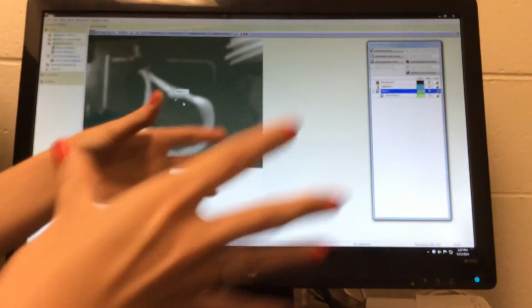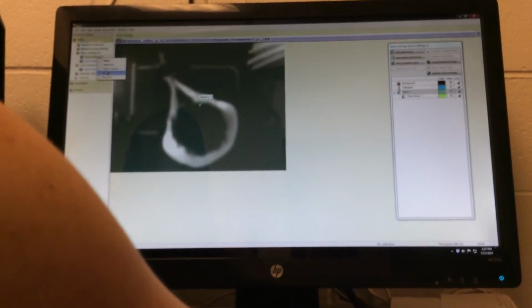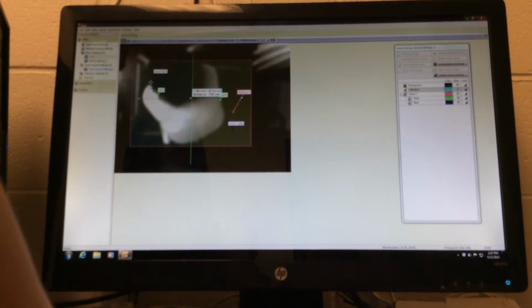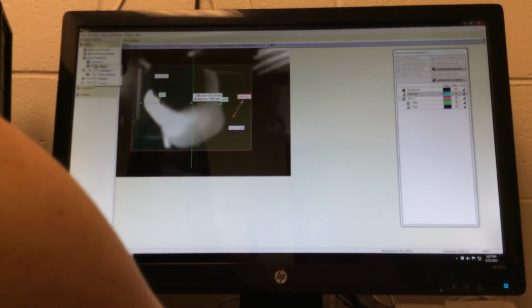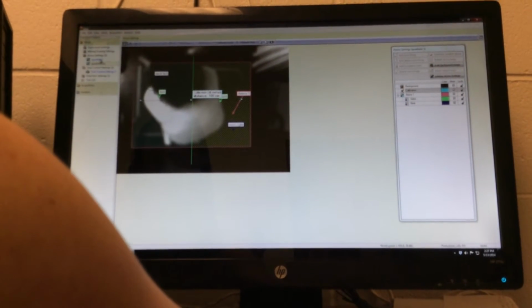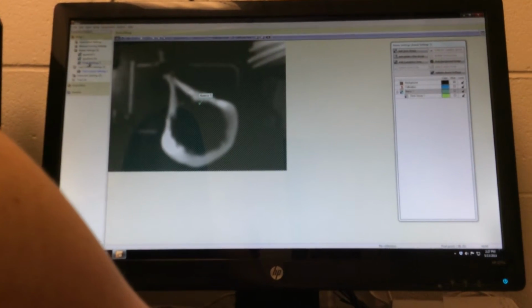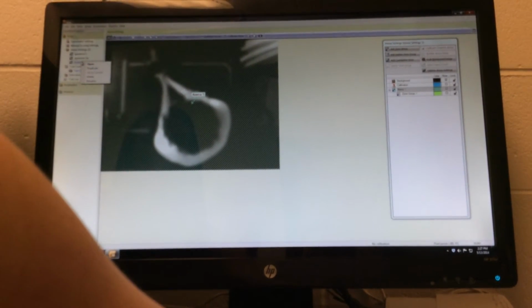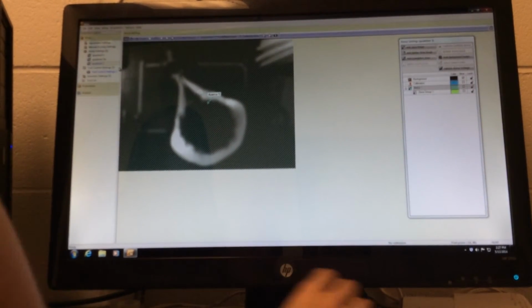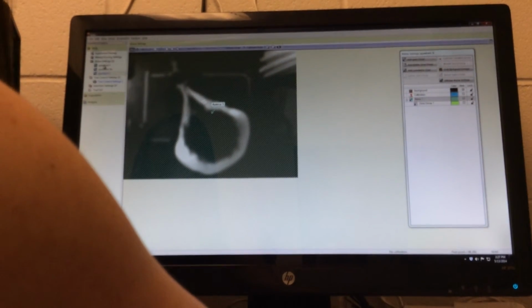So you would make the adjustments you need to, grab a new background, and then you can change the name of it. So I can call this one, let's say, quadrant 1 or something. Call this one quadrant 2. You can also duplicate it. And now I've got a new one, and it's exactly the same as the first one. Oh, cool. So I can rename it. So that looks pretty good. It helps to make things go a little bit faster in terms of setting up the new ones.